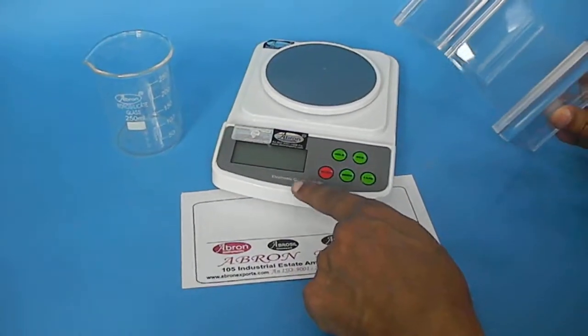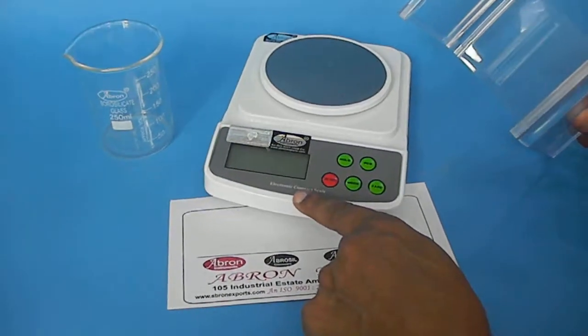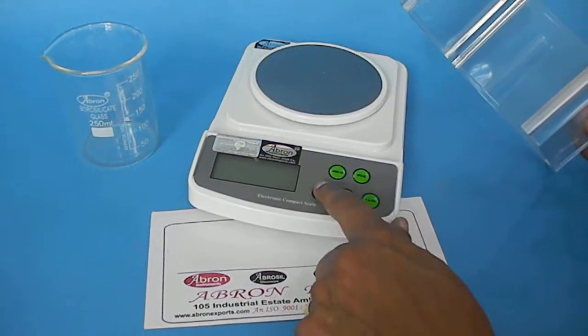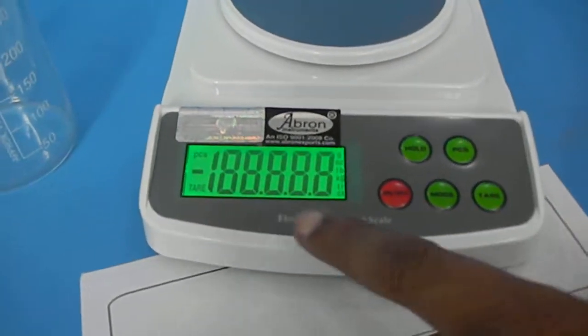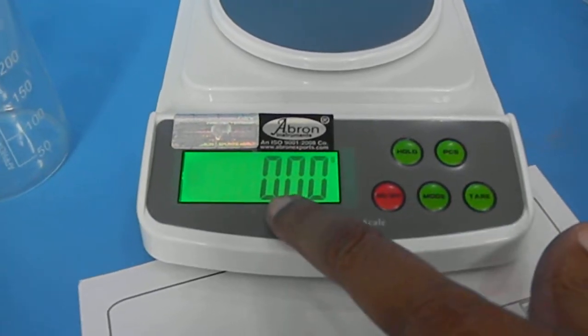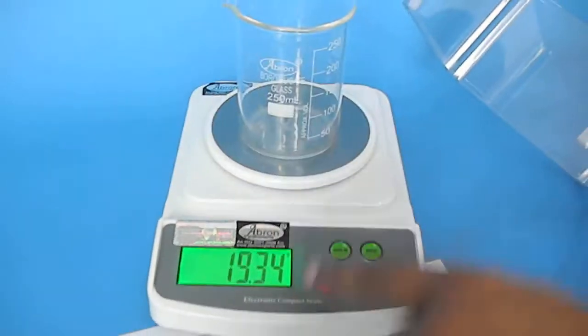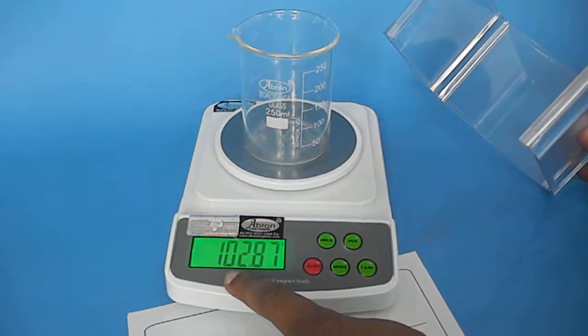This is the digital balance with 500 gram capacity and 0.01 accuracy. When you switch it on, it gives you the accuracy of 0.01. You can see now it shows 102.87.